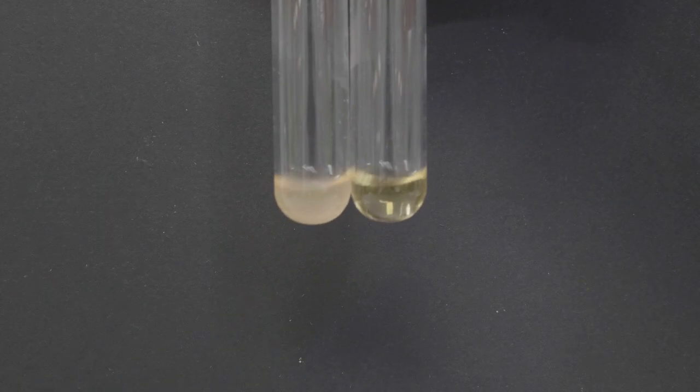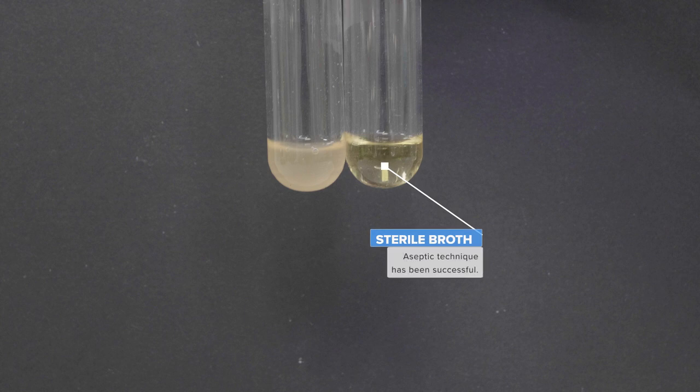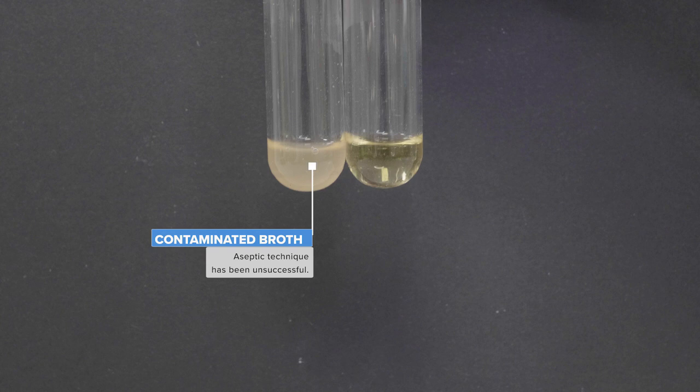Your tubes will then be incubated to allow any contaminating organisms to grow. Here we can see two example results. On the right we've got a broth where aseptic technique has been successful, whereas on the left an environmental contaminant has grown causing the media to become cloudy.